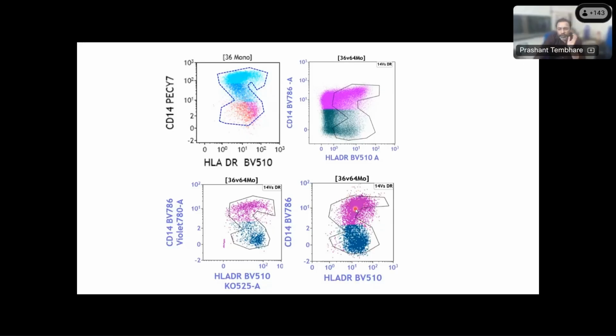These patterns are usually seen in myeloid and monocytic lineages. They are commonly seen in MDS, but can be seen in other neoplasms like CMML as well as JMML.